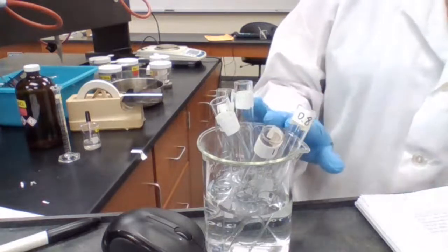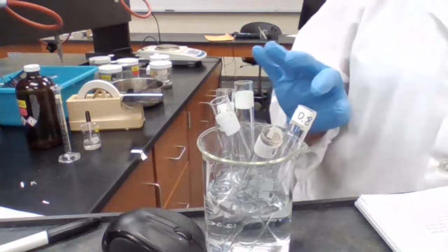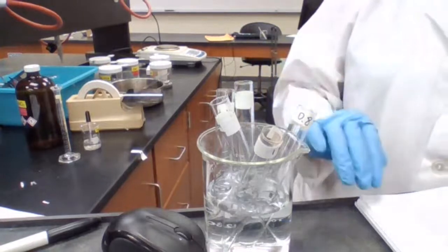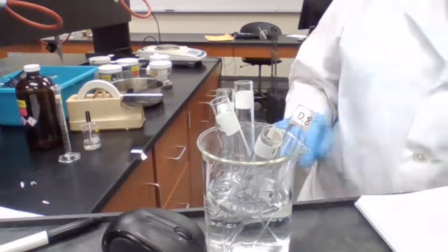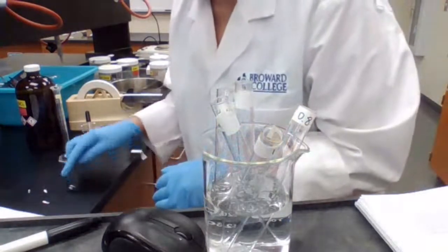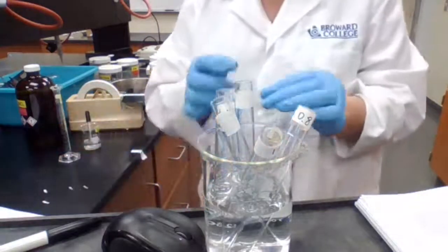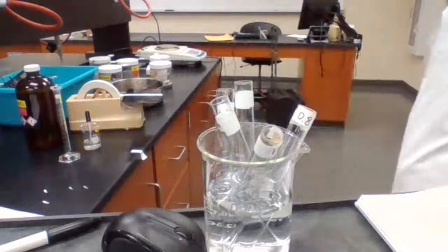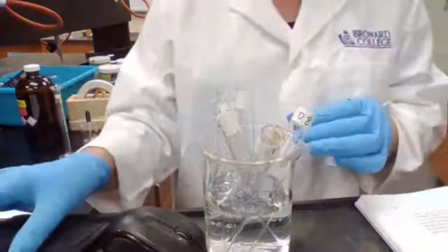We keep them in the water to make sure that they are all at the same temperature, so the temperature doesn't change. And I have 5 pieces of magnesium. With the 5 pieces of magnesium, I'm going to find out how long it takes for each one to dissolve completely.